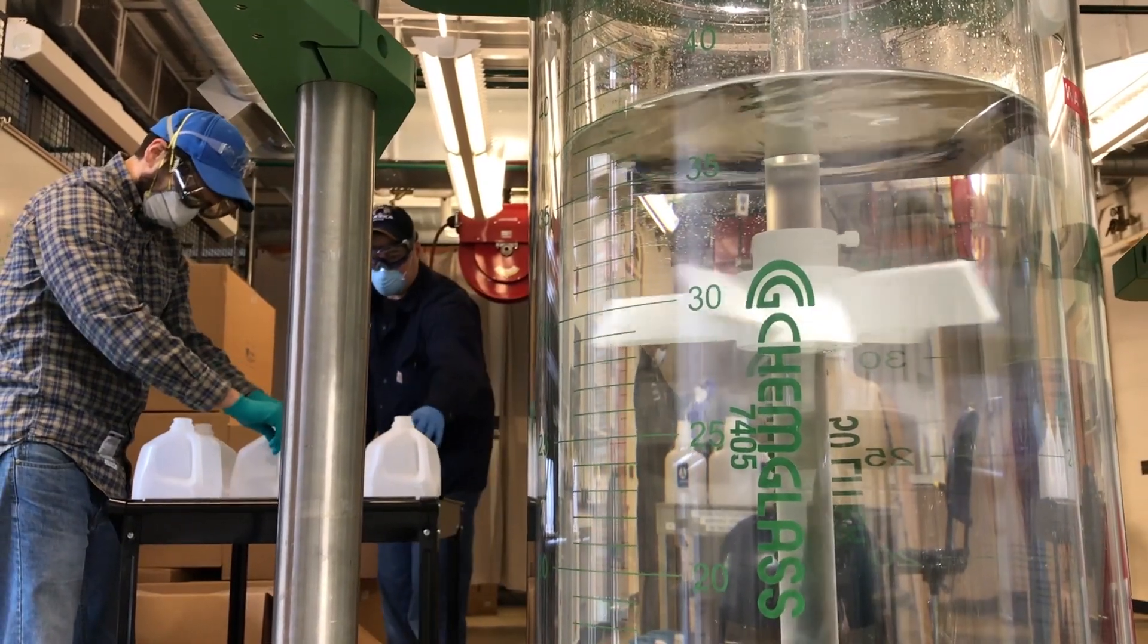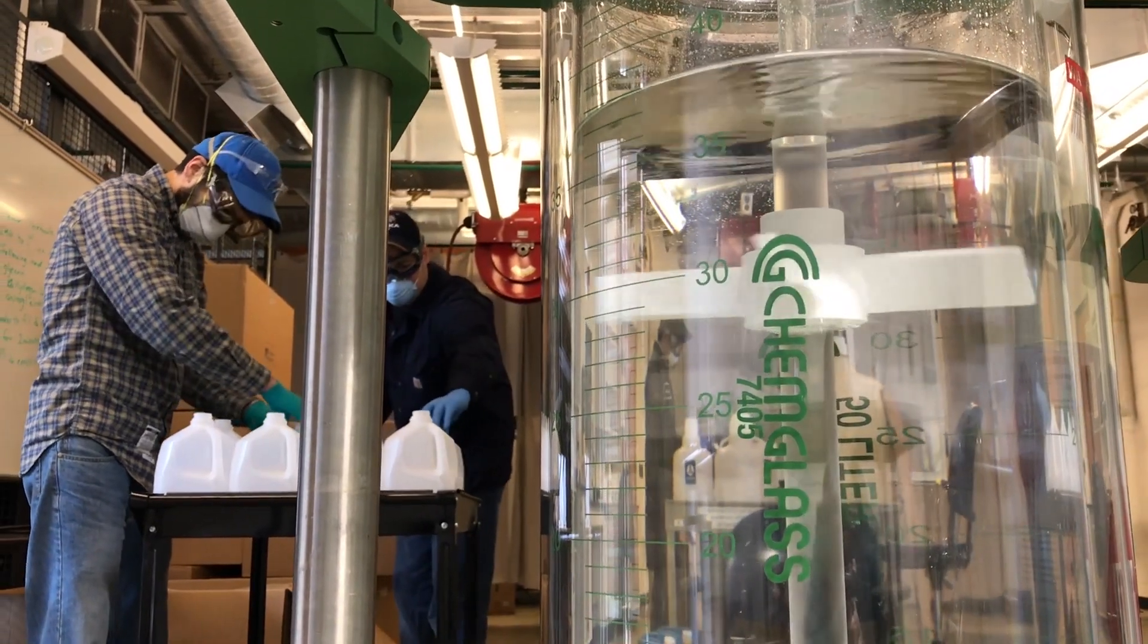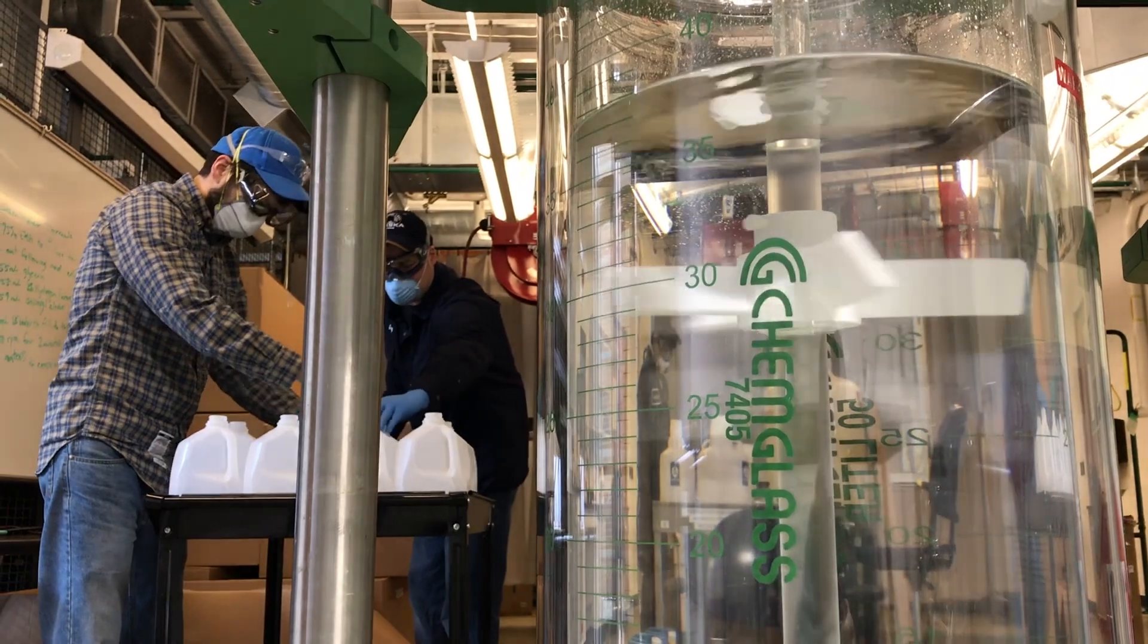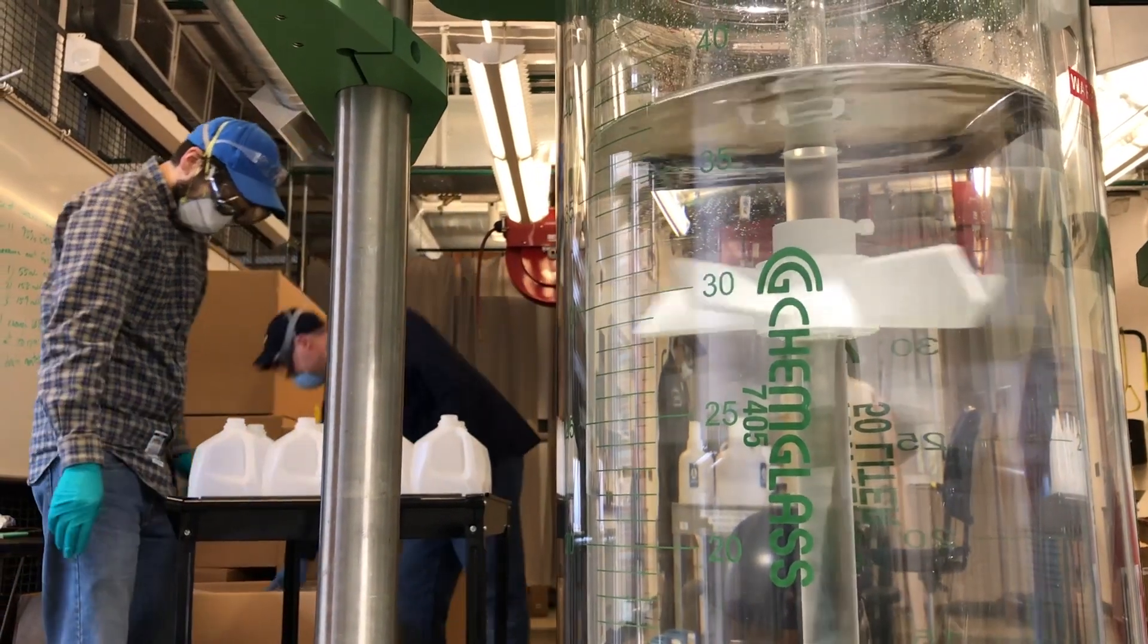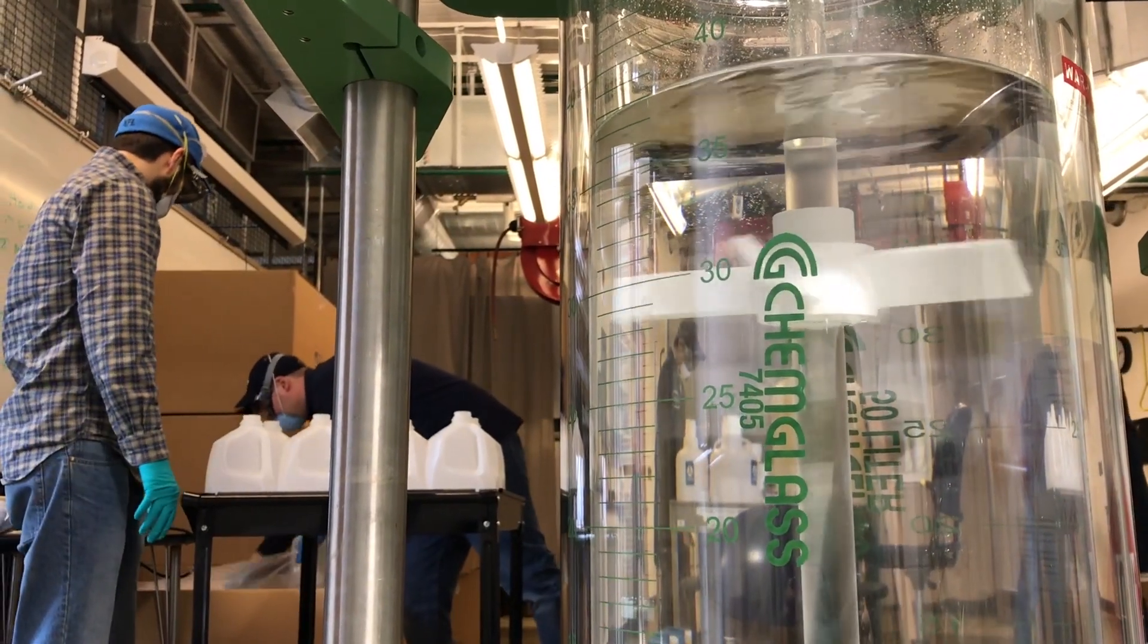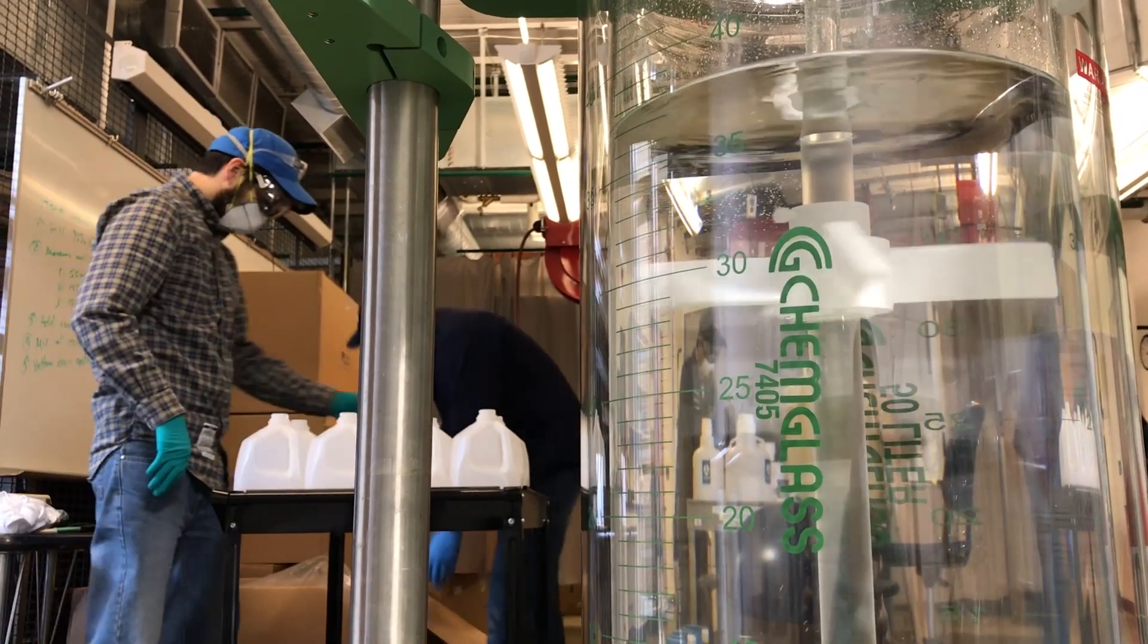Once we've done that, we take a sample from the reactor to verify we're at the appropriate alcohol level, and then we bottle the rest.